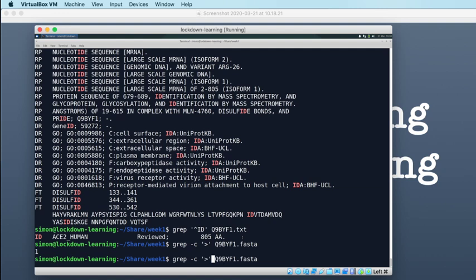Okay, so if we forget our quotes, do we remember what the greater than symbol does? The greater than symbol is for output redirection. It takes the output of our command and redirects it into a file. So when Bash sees this command, it sees, okay, I'm going to run grep, and my option for grep is -c, but then, oh, I've got no input. All I'm doing is redirecting the output from this command, which will fail because it's got no input, into this file. And this file is actually your input file, but in this command, without the single quotes, that file is becoming our output file.